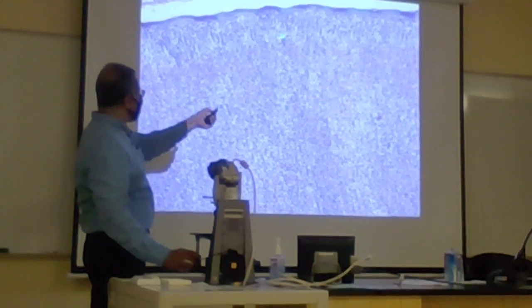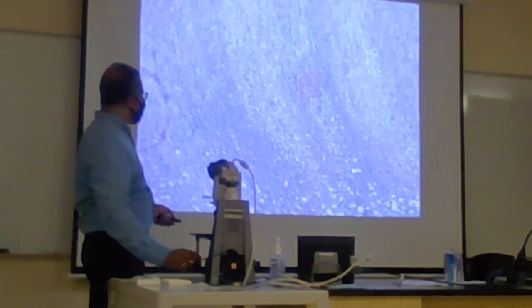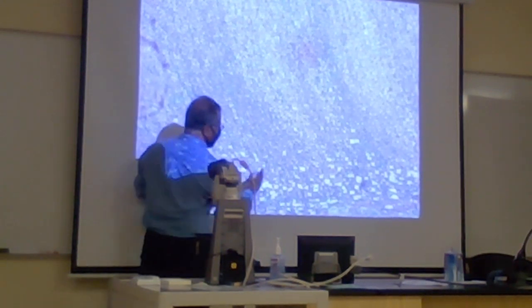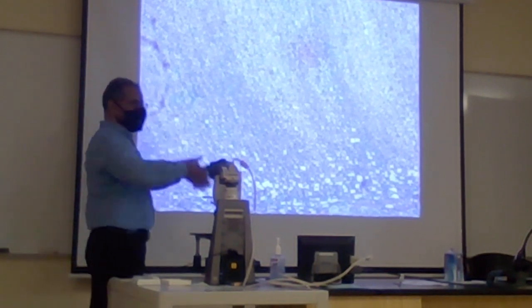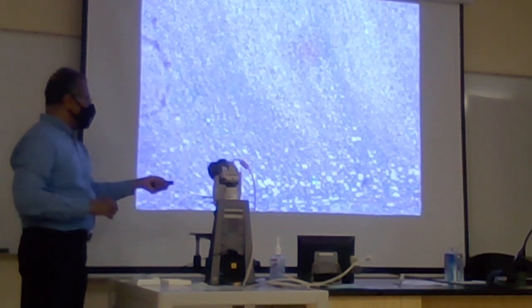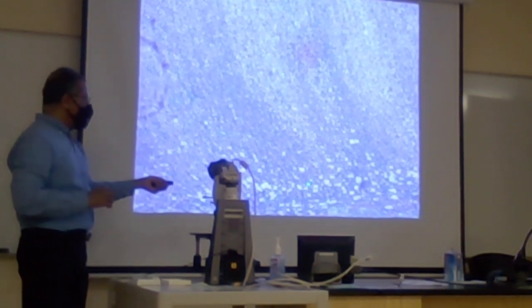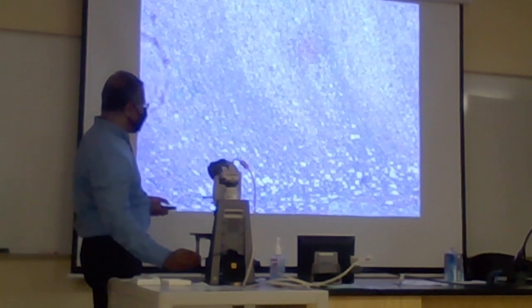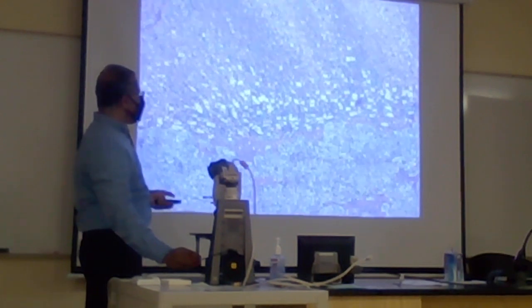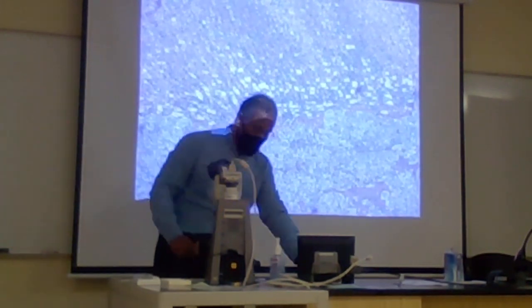So this is the zona fasciculata. You see the kind of line. And then as you come down here, you can see it's different. Here the cells seem to be arranged in a branching network, not like parallel columns anymore. They're like branched networks. That's why it's called zona reticularis, responsible for gonadocorticoids. And then if you go further into the core, you get the medulla. That's what you look for in the adrenal layers.